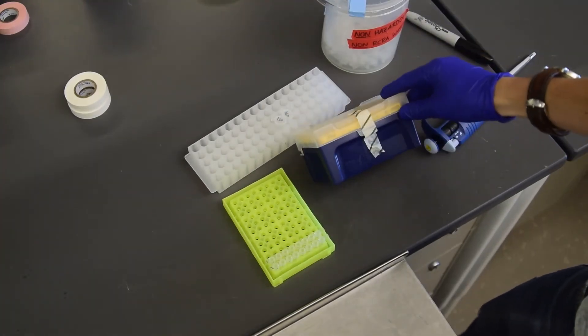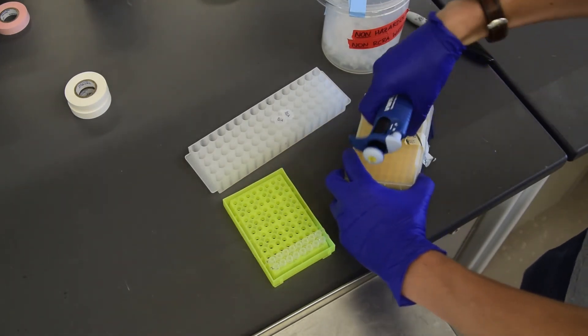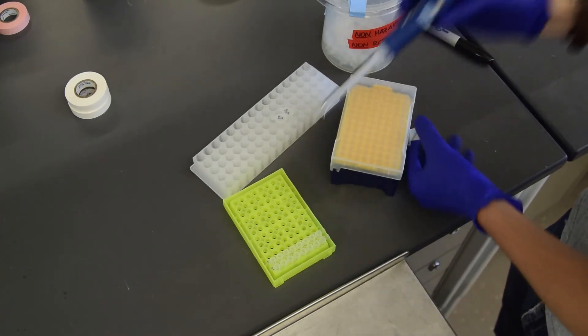After this cycle completes, add 40 microliters of water. You should do this on the pre-PCR bench, changing tips each time. These samples are now ready to be used as PCR templates.